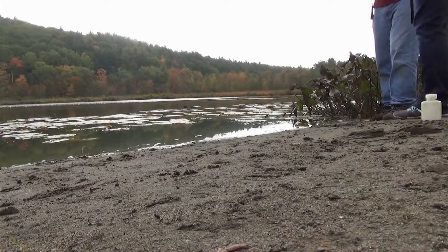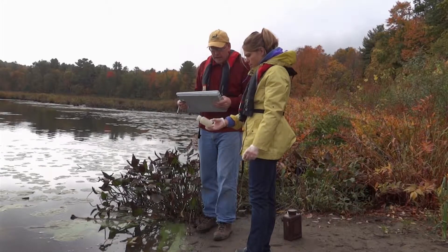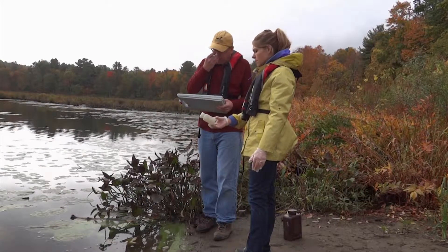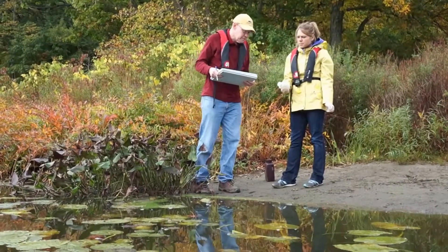You'll notice the algae bloom bottle has a red label on it, and the label indicates the name of the lake and the fact that this is an algae bloom sample. We'll go through the information on the label in a few minutes.